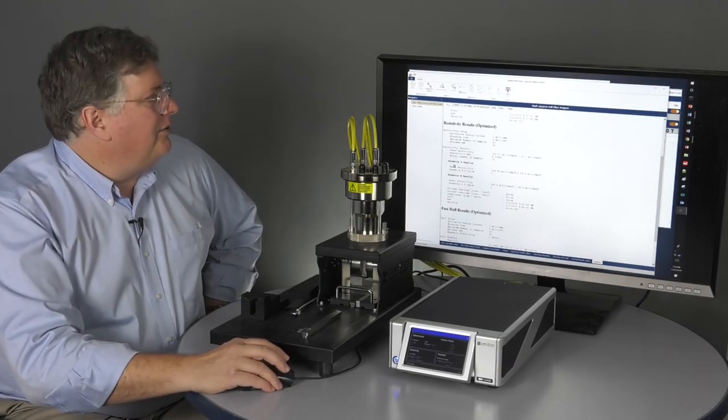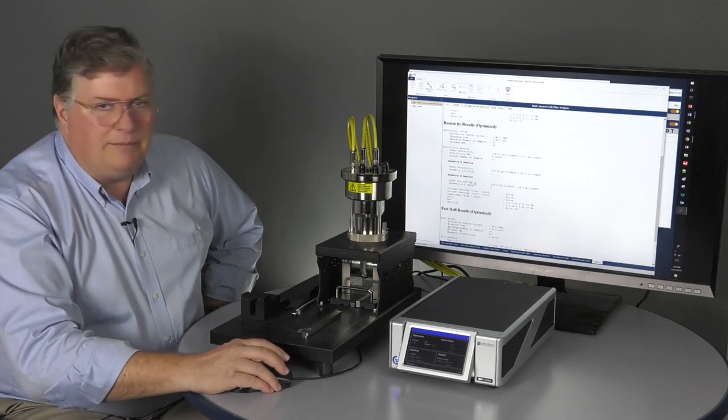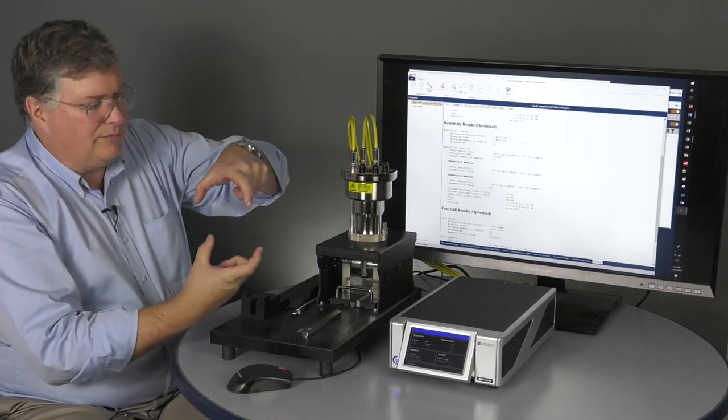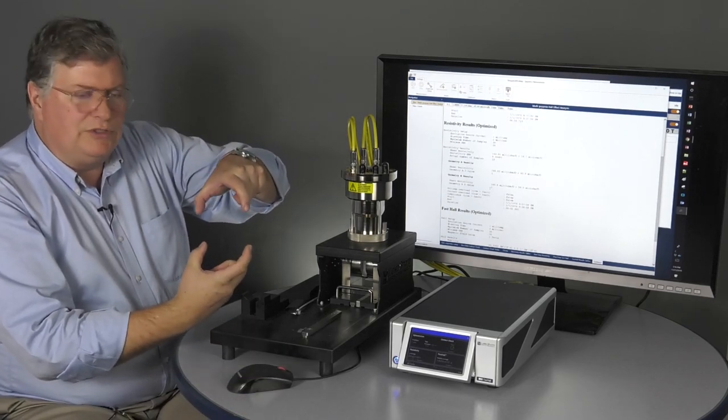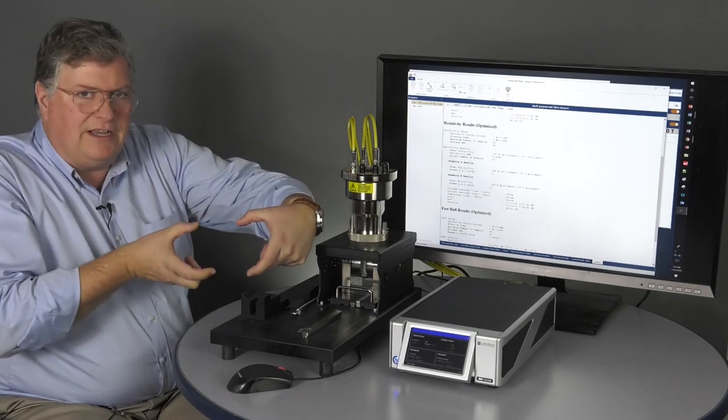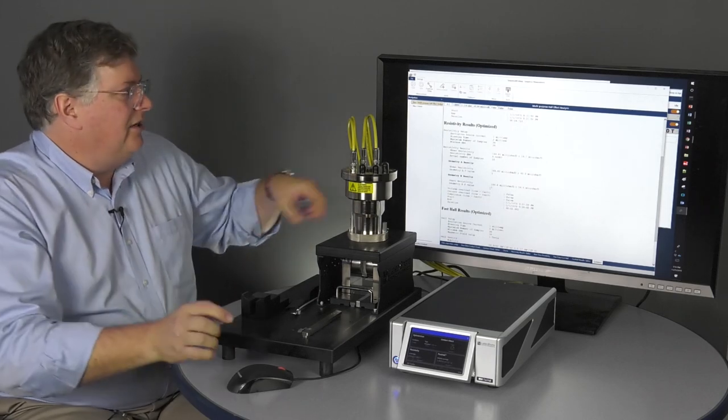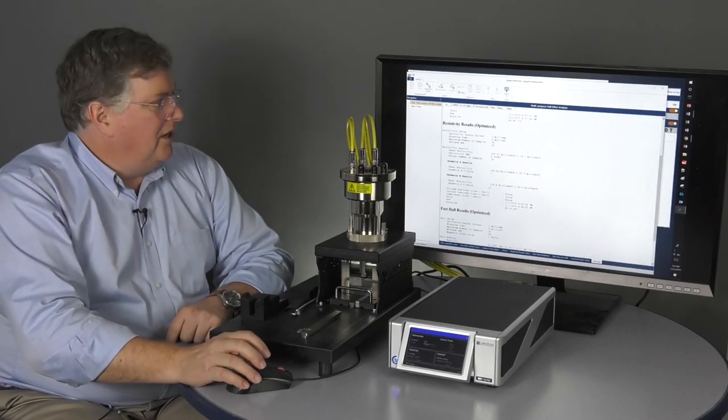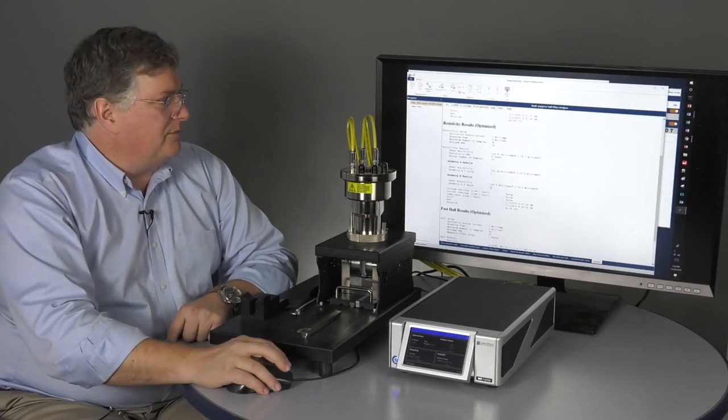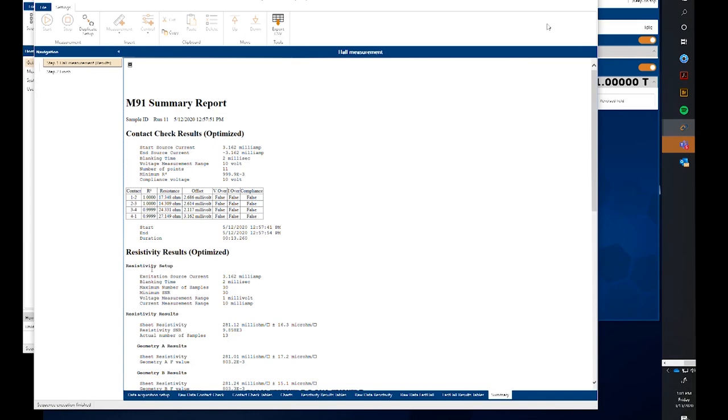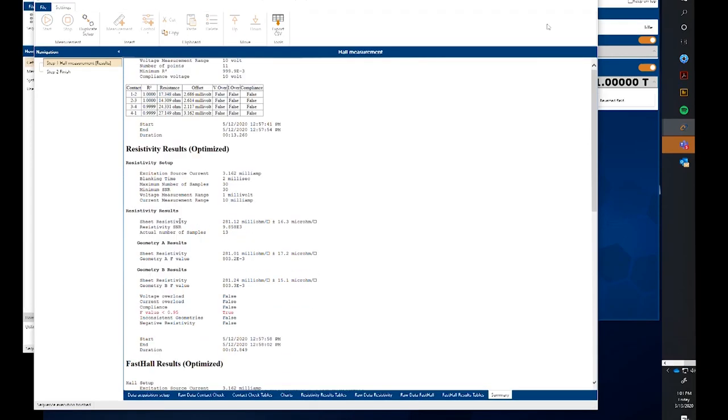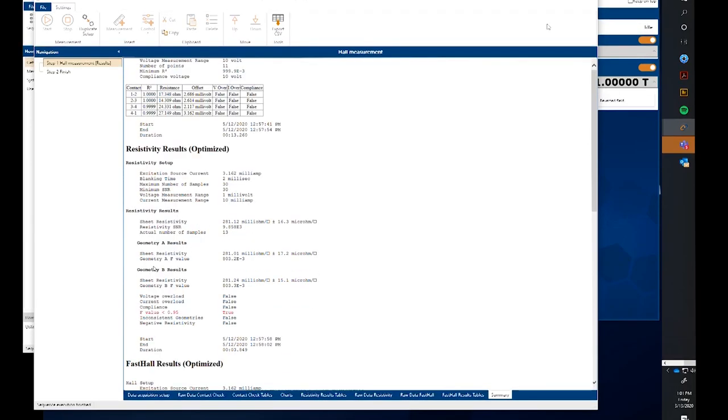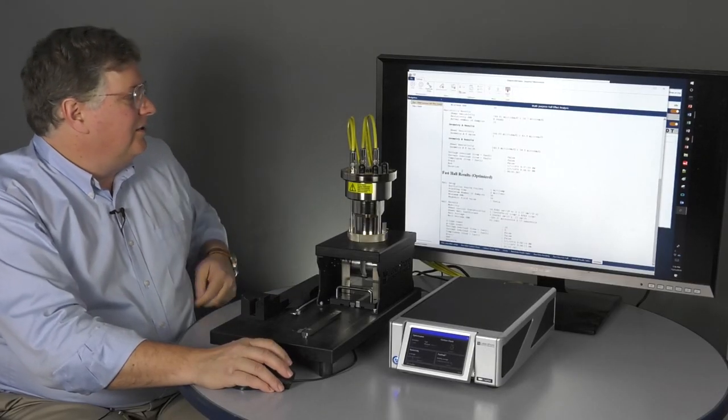The resistivity section here, we do calculate results for both A and B geometry. In resistivity, we're measuring the four sourcing here, measuring here, and then we can rotate 90 and do a second geometry. All of those are using current reversal in each of those measurements. And all of the measurements are saved in the data files, but we give you the results here for A and B and the overall results are shown there.